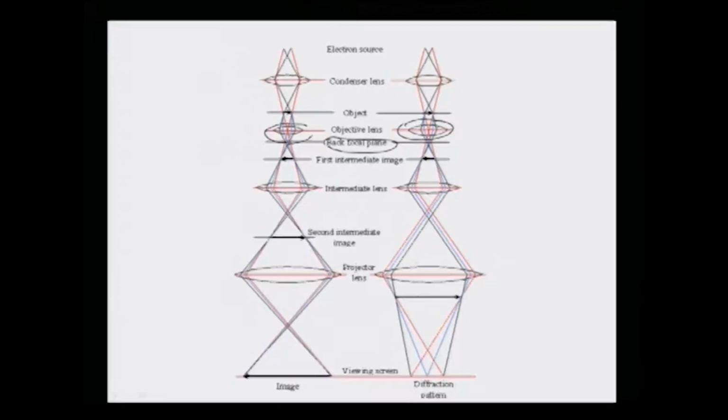And if the object is periodic, that is a crystal, then the diffraction pattern will be periodic. If the object is continuous, the diffraction pattern will be continuous. These are all understandable. This is basically the classic sense of diffraction pattern formation in a classical TEM. So that is routinely done in the microscopes. Whenever we insert a sample, first we find the crystals, then put the selected area aperture in and get the diffraction pattern. Any electron microscope user who is seriously doing microscopy can immediately recognize this.